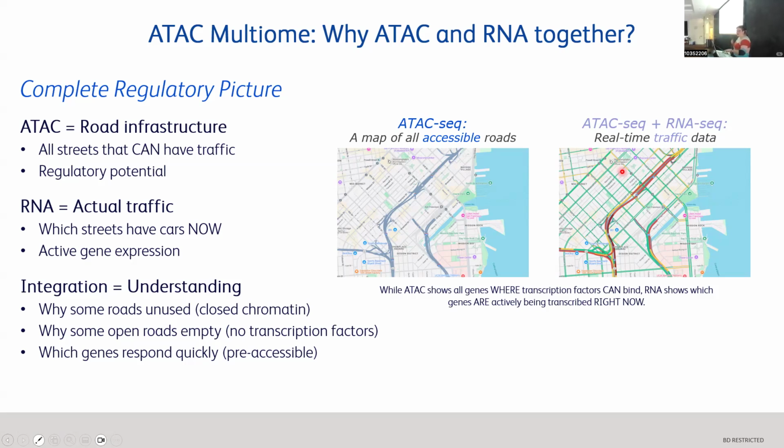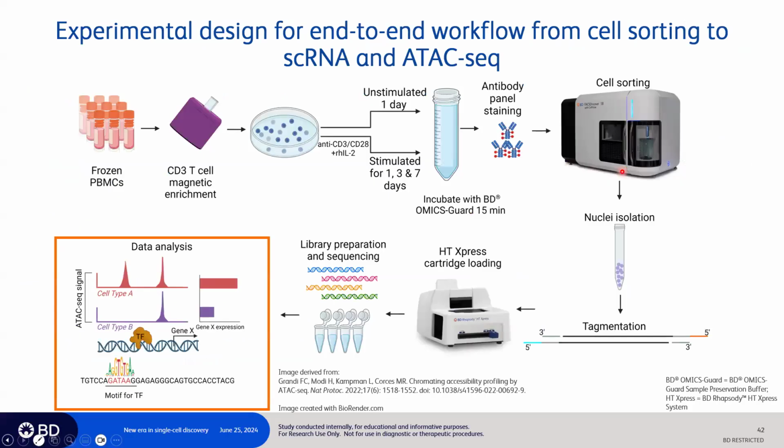This is an example of a type of experiment one might do for ATAC multiome, and this actually was a study that was generated in-house, but we do have a webinar where they go over what they did. If you're interested in that, we can send you that link.